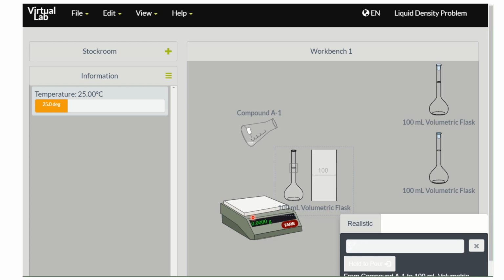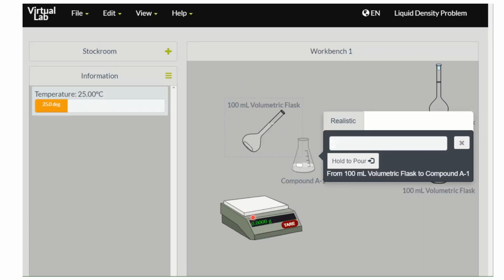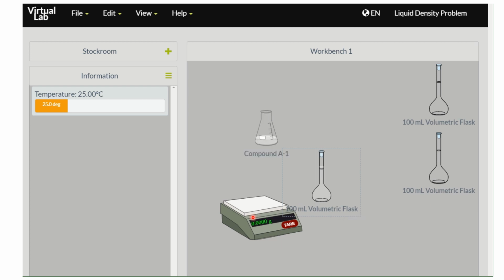It's okay, you can pour back again until you finally get it. As you can see here, I poured past the fill line. So the thing is, you have to pour exactly where that fill line is in order to know that it's exactly 100 ml. So you can see me here pouring back into the flask and then pouring again back into our volumetric flask. Now I didn't get it exactly to be 100 ml. It was slightly too much. It's okay. Try your best to get it to be 100 ml.